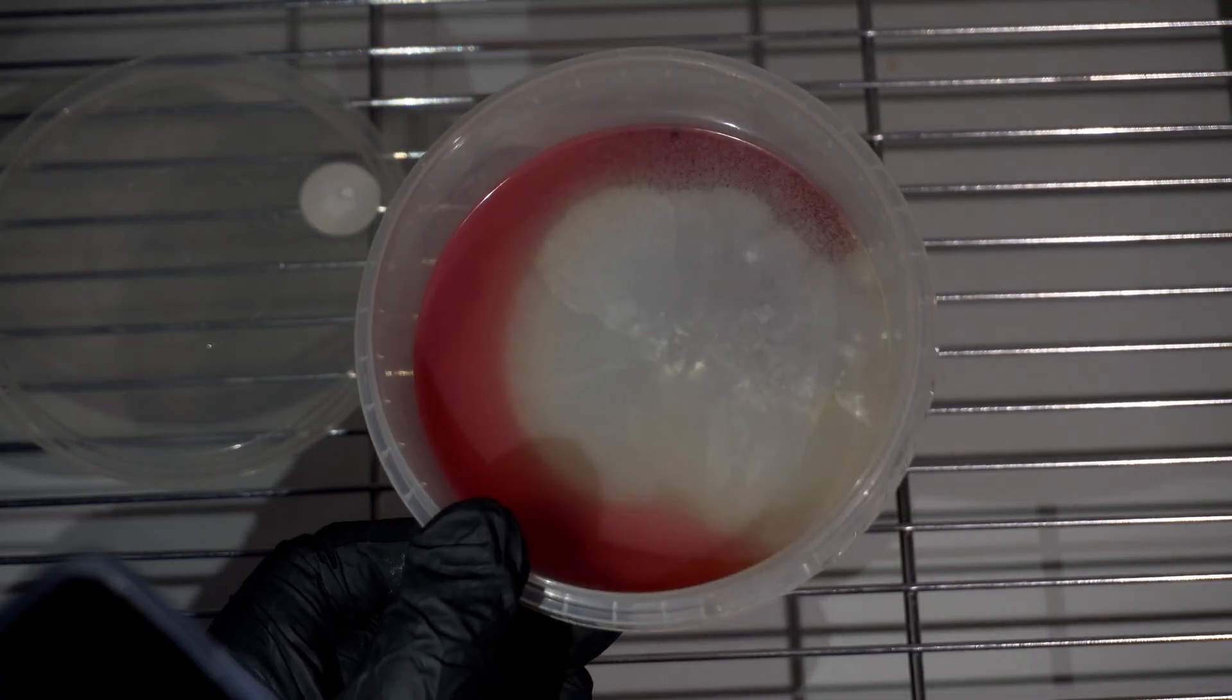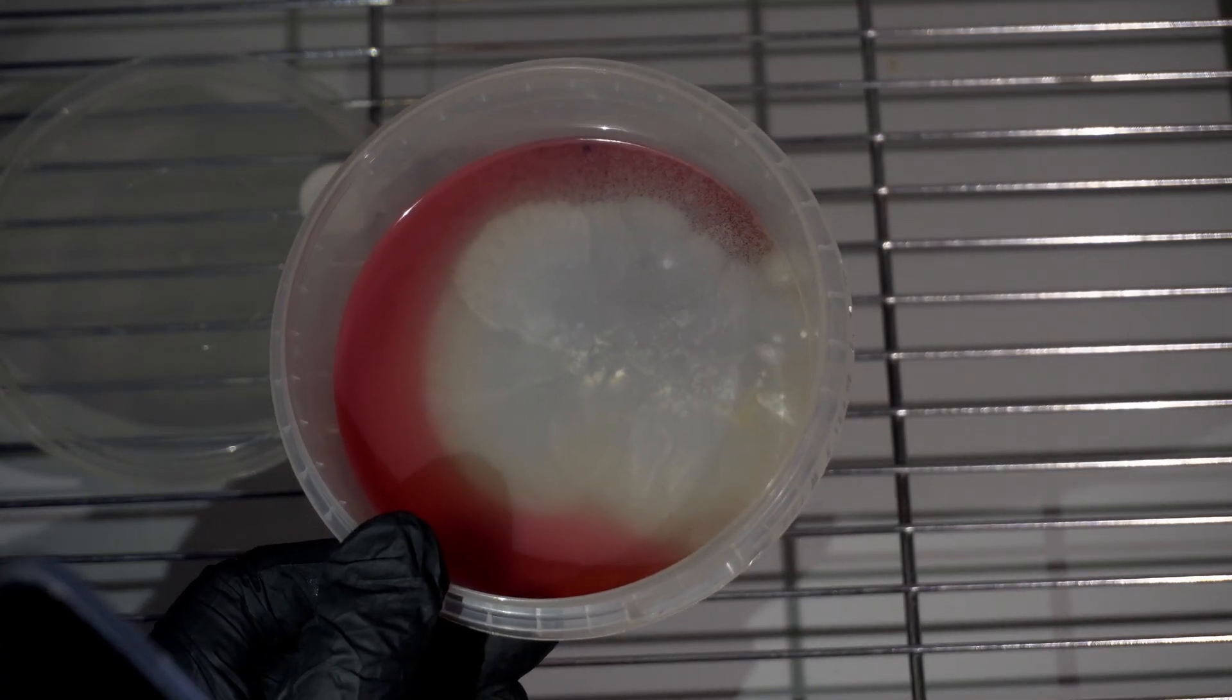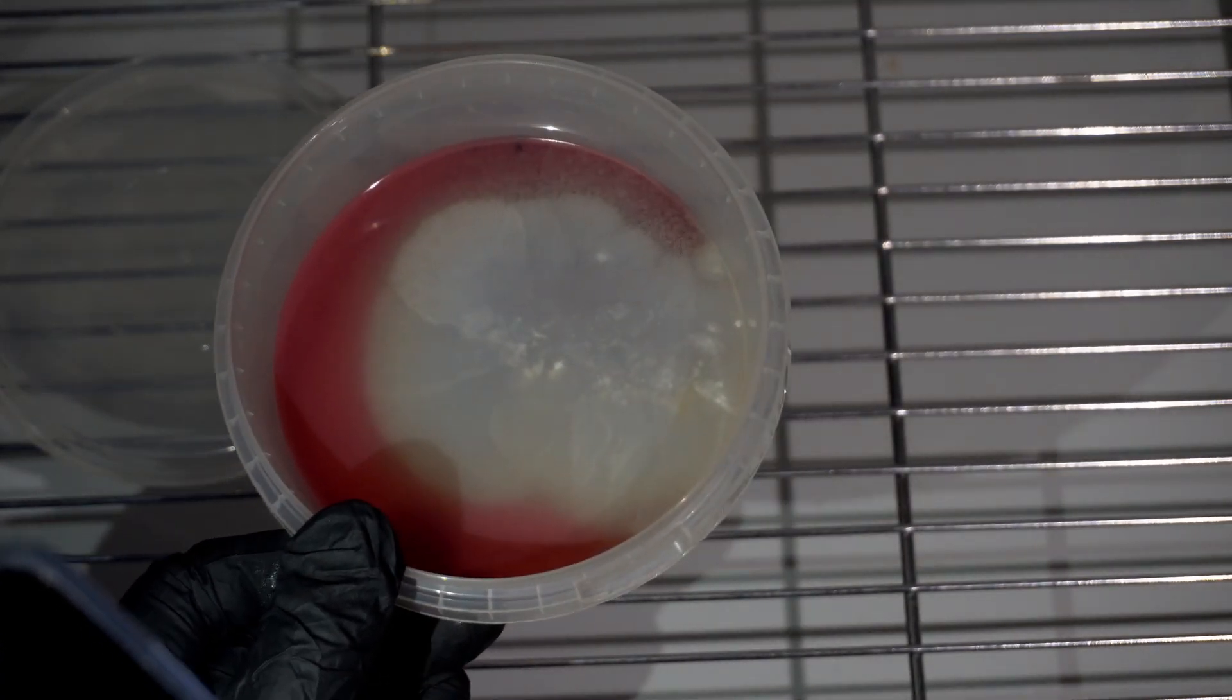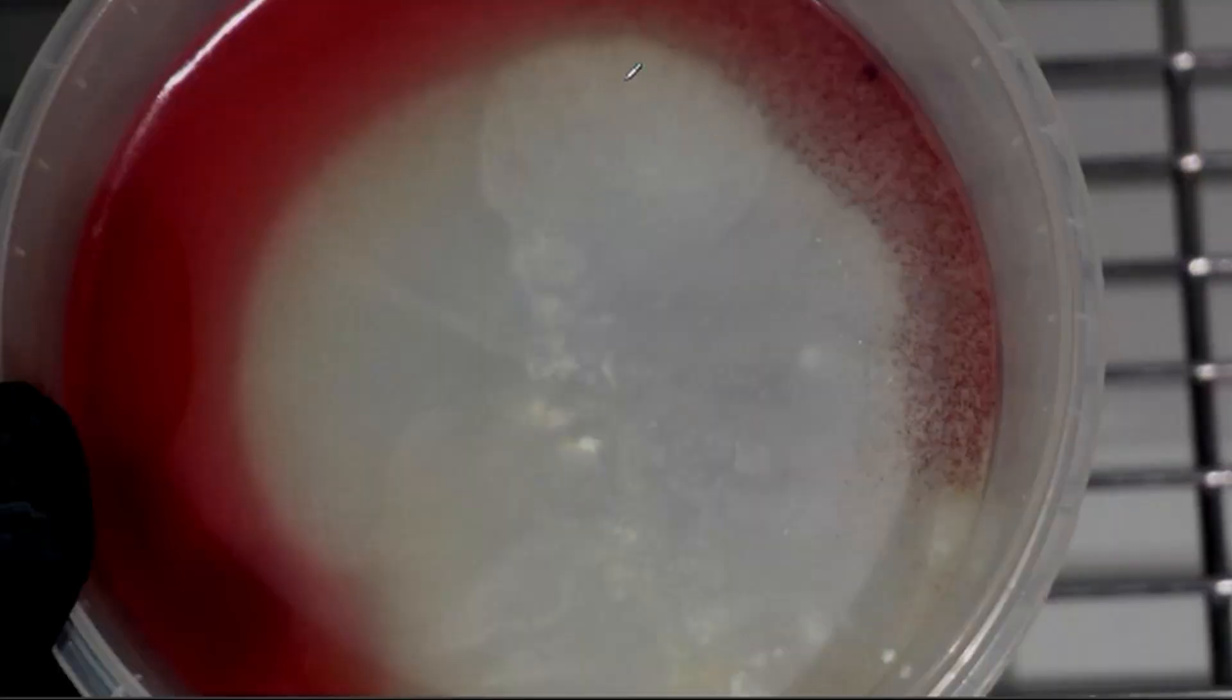If you just look at the agar plate, you can see here there's some symmetry and then you can see the leading edge, which is the strongest mycelium growing the fastest. A load of genetics have probably fused to create these patterns and you can see where the borders of each of them are.